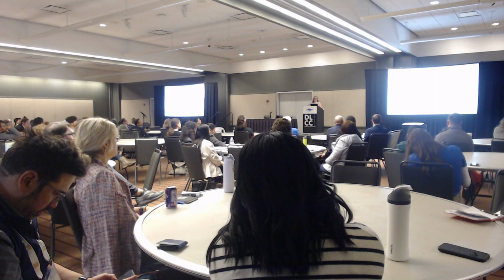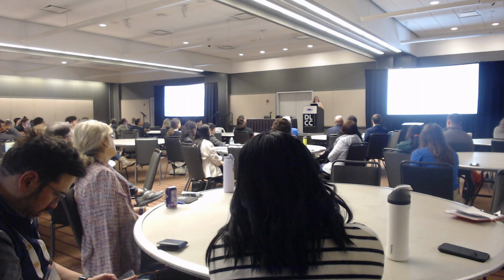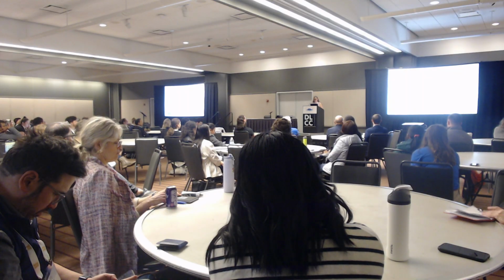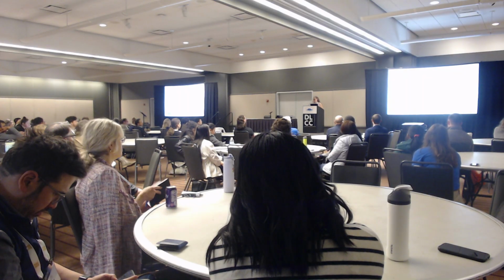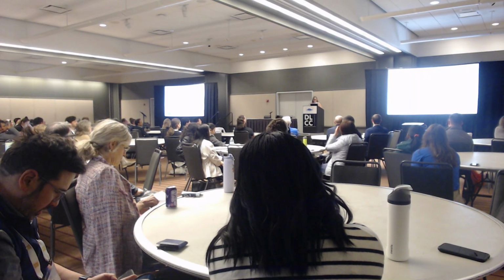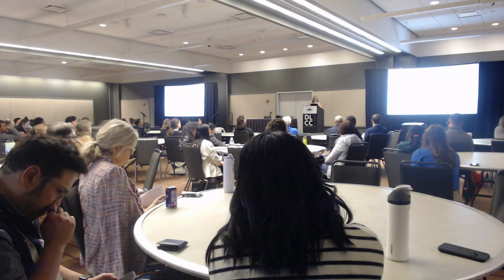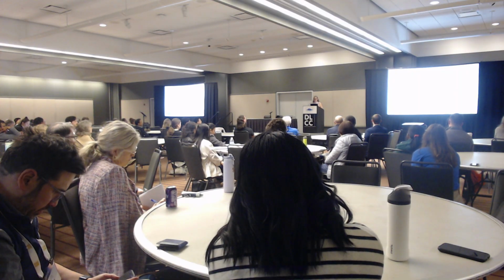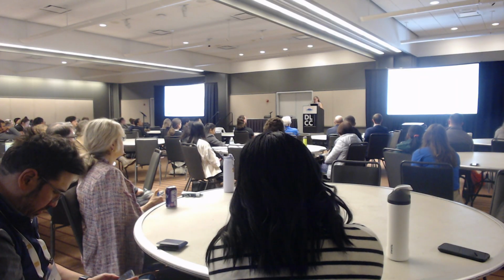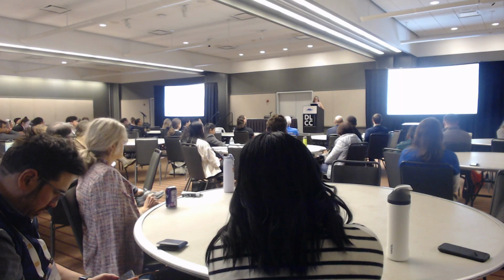It's in cancer. And it was actually one of the first projects that I worked on after starting the core, where this group had produced whole genome bisulfite sequencing and 5-hmeDIP on HPV head and neck cancer samples. Not only that, they also had genotype, and because it's HPV, they have viral integration, and they've run everything. And that cohort has been going on for, I can't remember when.